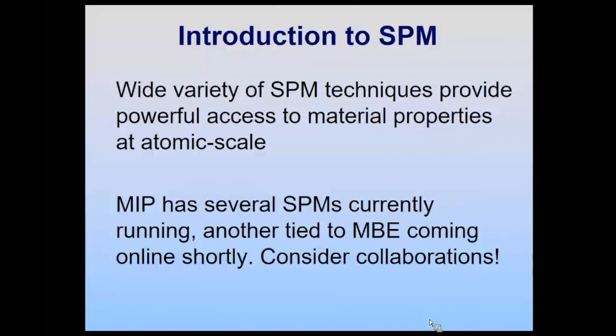We have two good questions queued up online. One is, in the case of niobium diselenide or other TMD surfaces, can you remove a selenium atom with the SPM tip?